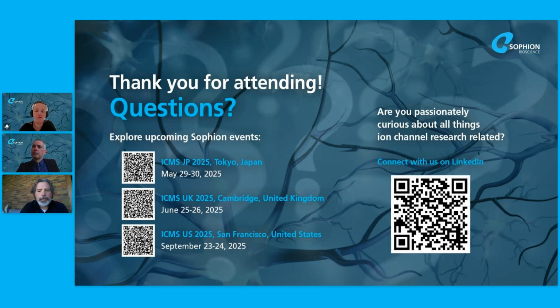Yeah, sure. Great question. Thanks. So I can speak to what we know for our induced excitatory neurons on this, maybe first and foremost. As I showed, as part of the characterization, we have done some RNA expression comparisons between our apparently healthy normal and our FTDs. And we do see very similar expression of things like synaptic markers, synapsin-1, PSD95, key glutamatergic and neuronal markers like beta-3 tubulin, vGlut1 and 2, AMPA receptor subunits. In terms of sodium channels and ion channels, that would affect neural network firing and connectivity, and maybe some of the things that Kadla was observing, we don't see at the gene expression level much of a difference in sodium channel expression or potassium channel expression.